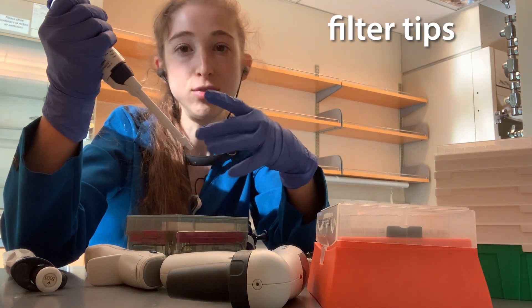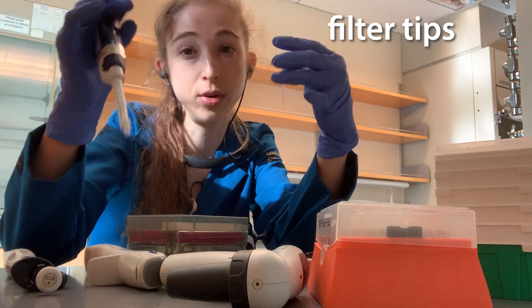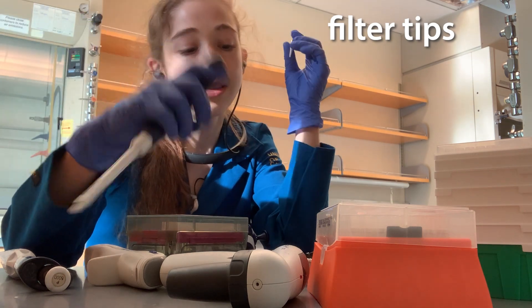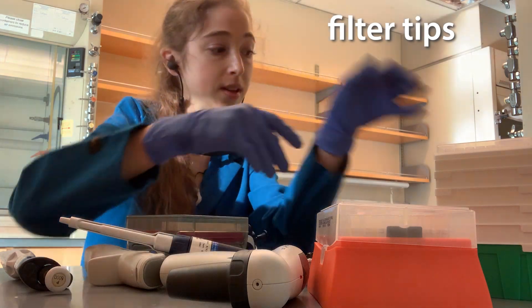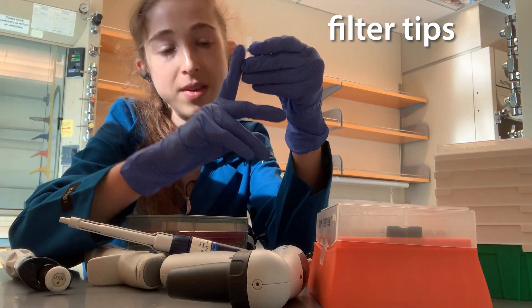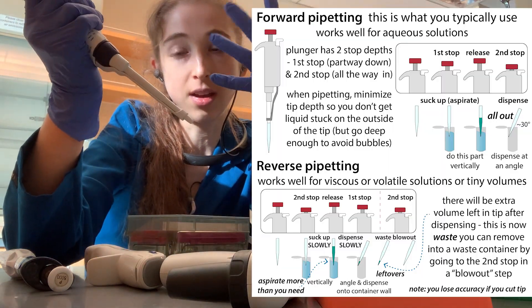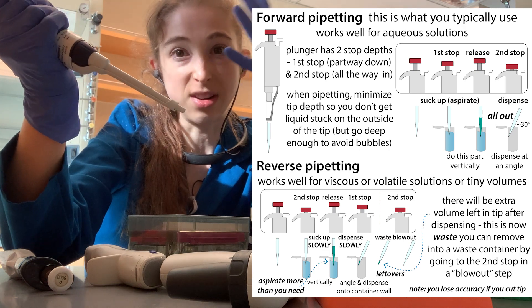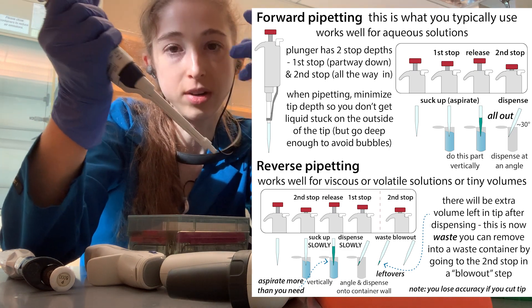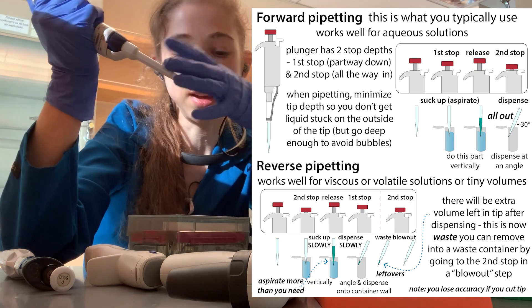Another thing: when you're pipetting, the filter is also going to prevent anything you're pipetting from getting up onto the barrel of the pipette, which is really important if you're working with radioactivity — you don't want that getting into the top. Also, if you use the wrong size tip, things can get stuck in the filter. Viscous or volatile things like ethanol have a tendency to splash back up, especially if you haven't pre-wet the tip beforehand, and that can get onto your other samples.